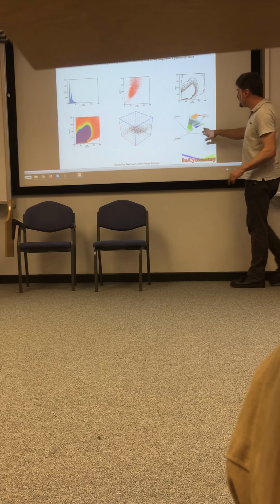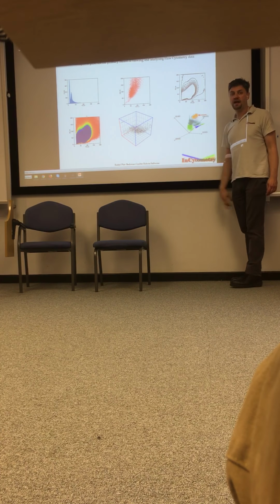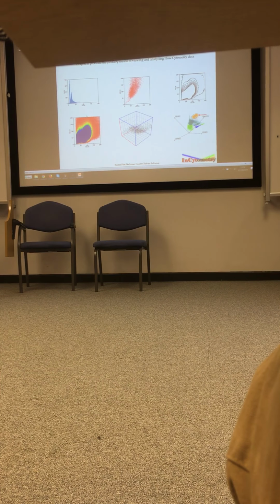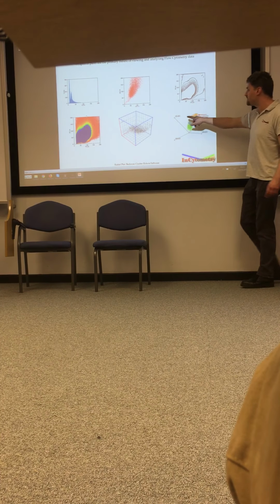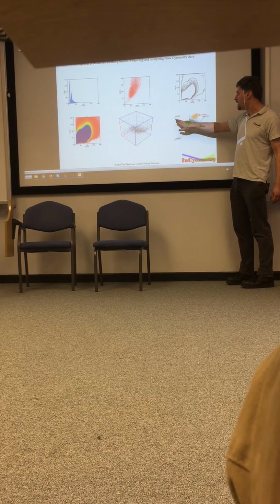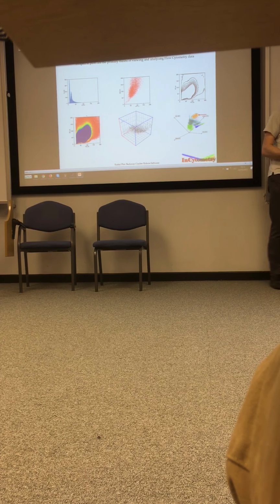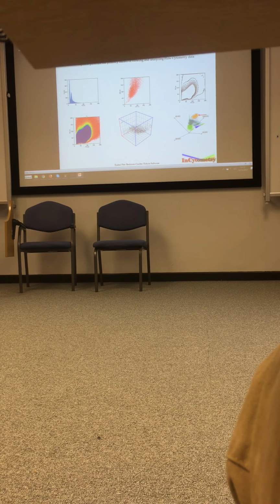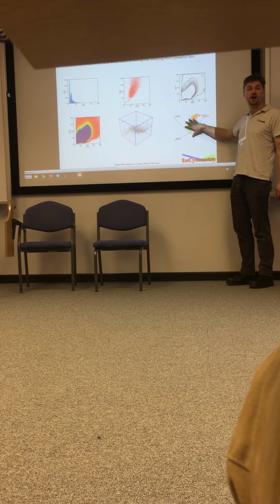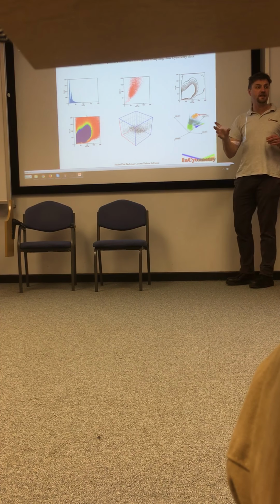So what they're attempting to do with this radial plot is, here they've put on 4 different axes. You can actually put on up to 12. The idea being that if we then take this and move it, any dots that move are CD4 positive, and the more they move, the more CD4 positive they are. You can get those animating and rotating around at various speeds. The idea being that you can put 12 different parameters on, and then move the axes around and see what populations appear, and then you can gate on those.